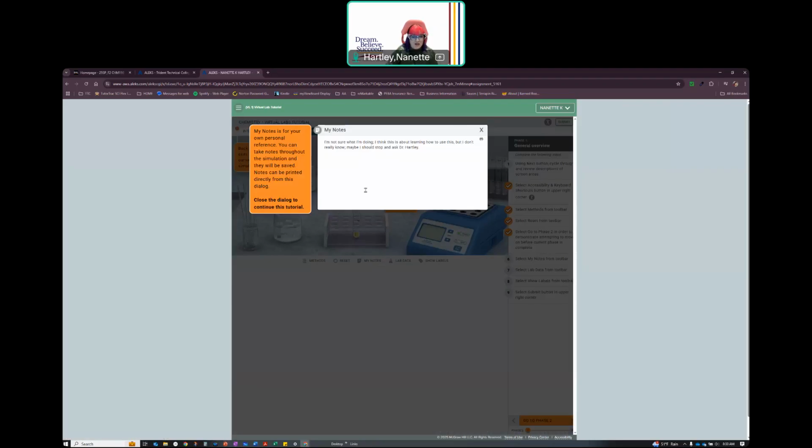This is outside of anything that I'm going to be writing down for lab data, but it's a place for me to take notes. It's just a place where I can write stuff down that I might observe. I mean, it's not necessarily part of my lab notebook.